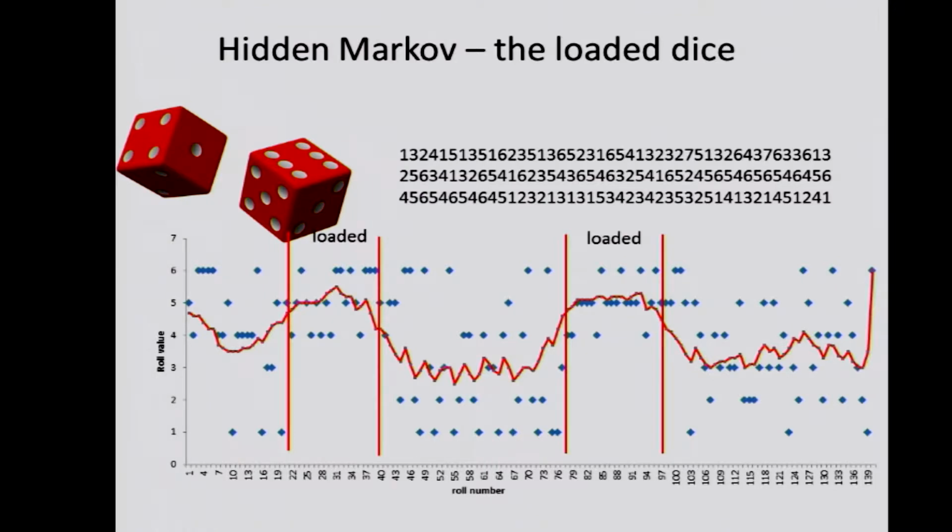What we end up seeing is these transition periods here and here, here and here. This is where, in my random number generator, I changed the parameters and started only generating loaded values, okay? Now I know that this was the unloaded state, the loaded state, back to unloaded, loaded, unloaded. Now, there's 1,024 different states of the 5-mer, so this is a much more complicated problem than what I've described here, because there's only 2 states. But it actually does work.